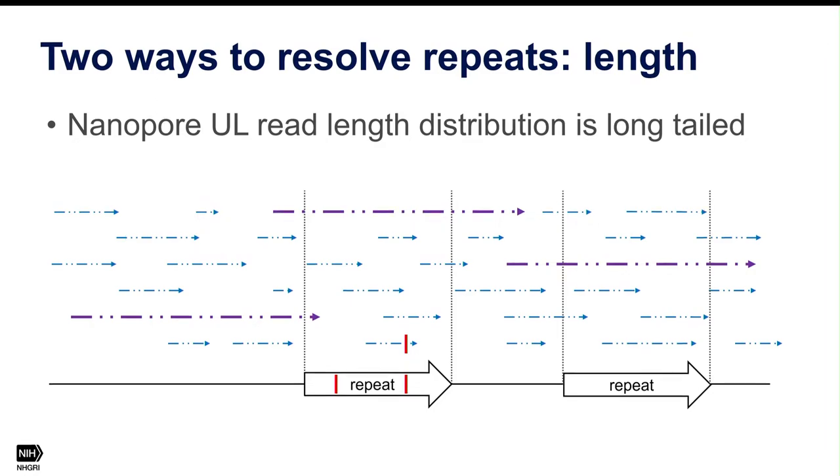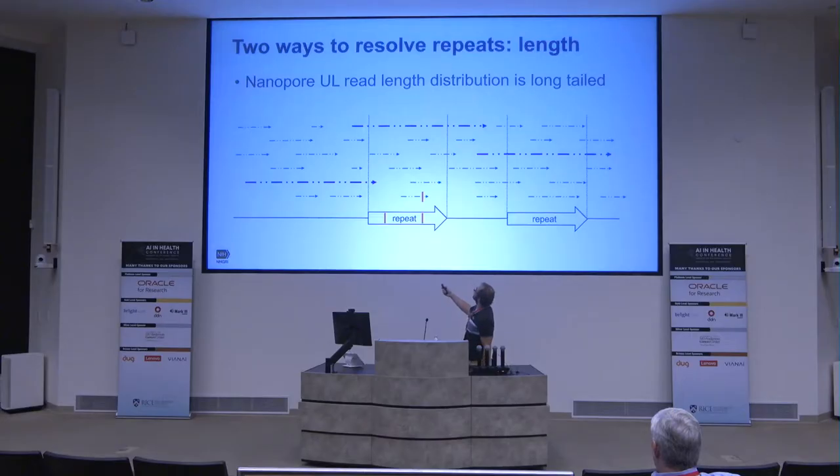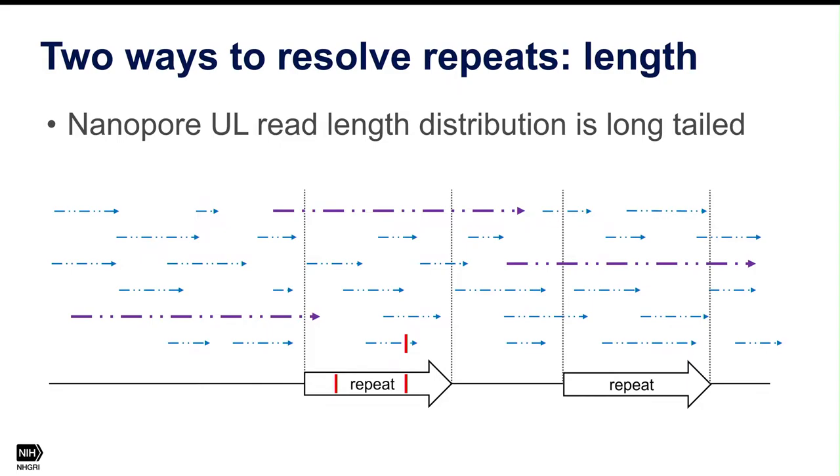We know we can walk the genome correctly through the purple path because the end here of this bit has to go over here because this sequence over here is unique, right? We can't connect. This bit is going to look different than this bit over here, right? And so that's very intuitive. It's a simple idea that if anything is shorter than your reads, it's not repetitive in your genome. And that's easy to understand. And so the nanopore reads help you resolve these repeats in this way.